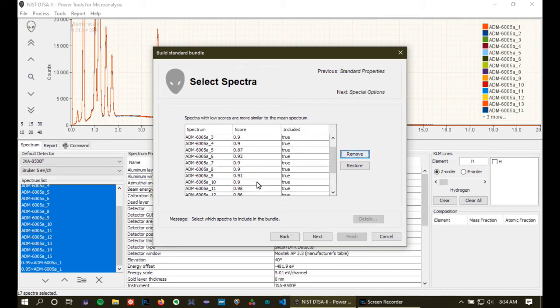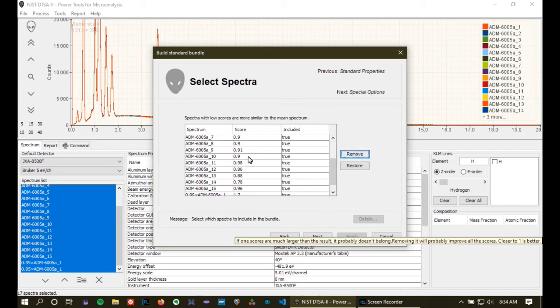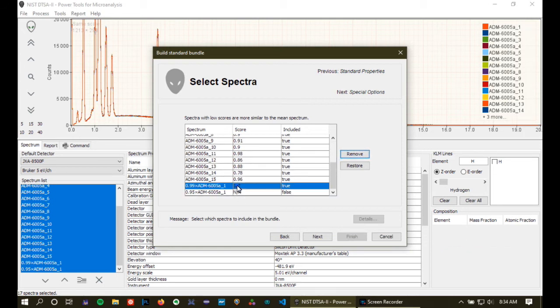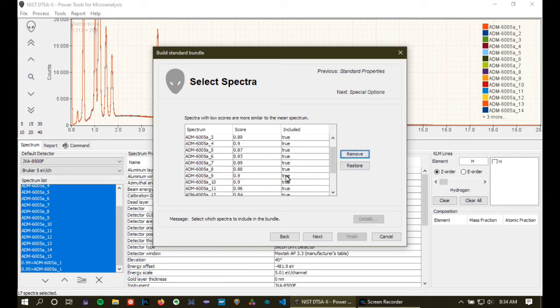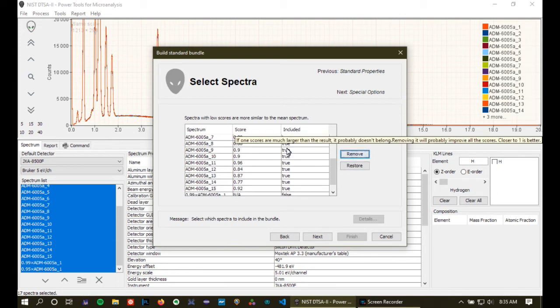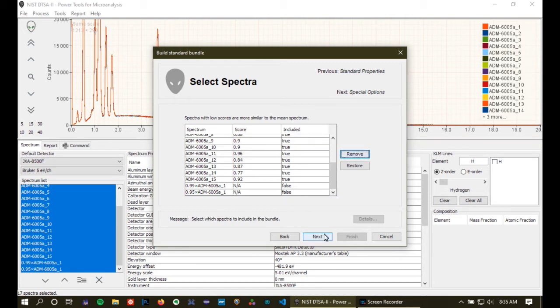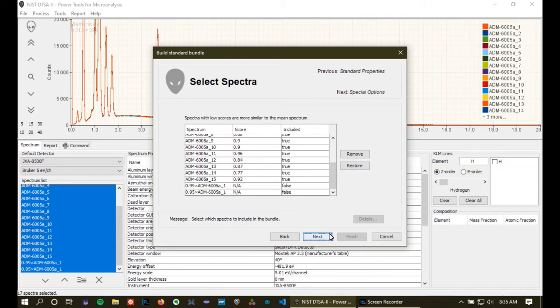Well, now all the rest of the scores have improved slightly. They're actually slightly below 1, except for, of course, this one, which is 99% of the intensity, so I'm also going to remove that. Now we've got scores that are looking really, really good. So we're actually going to make our standard bundle from 15 out of these 17 spectra.